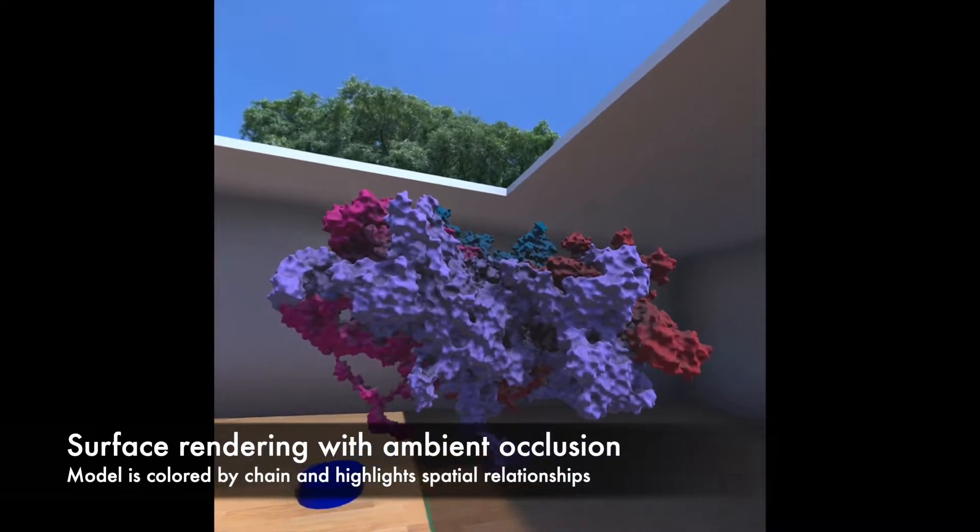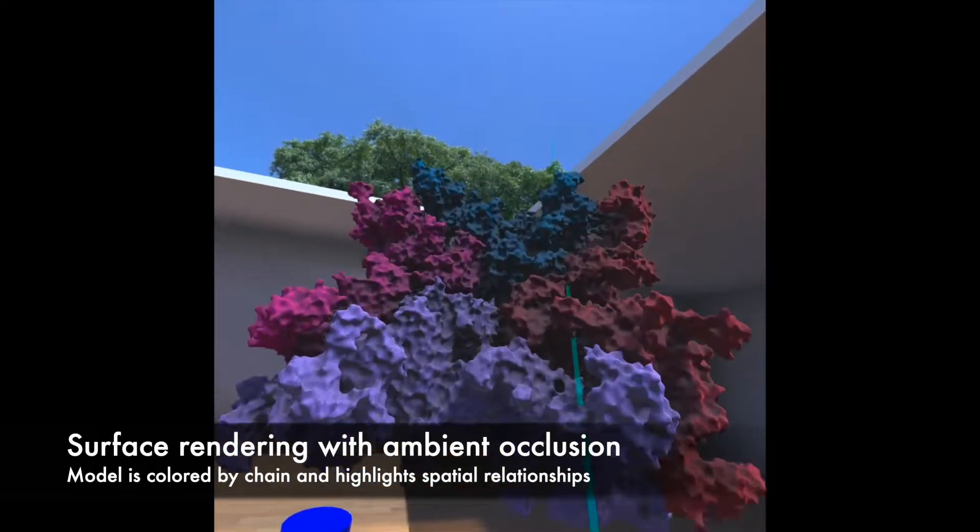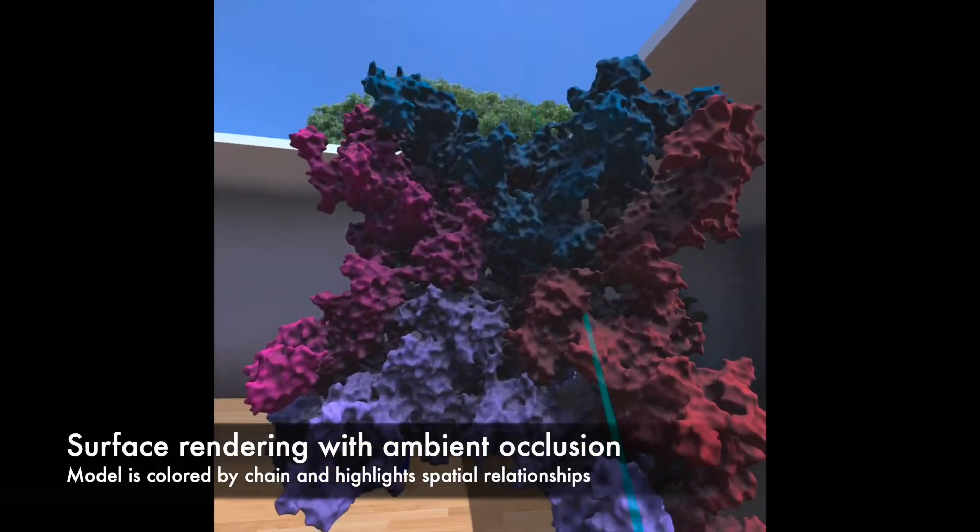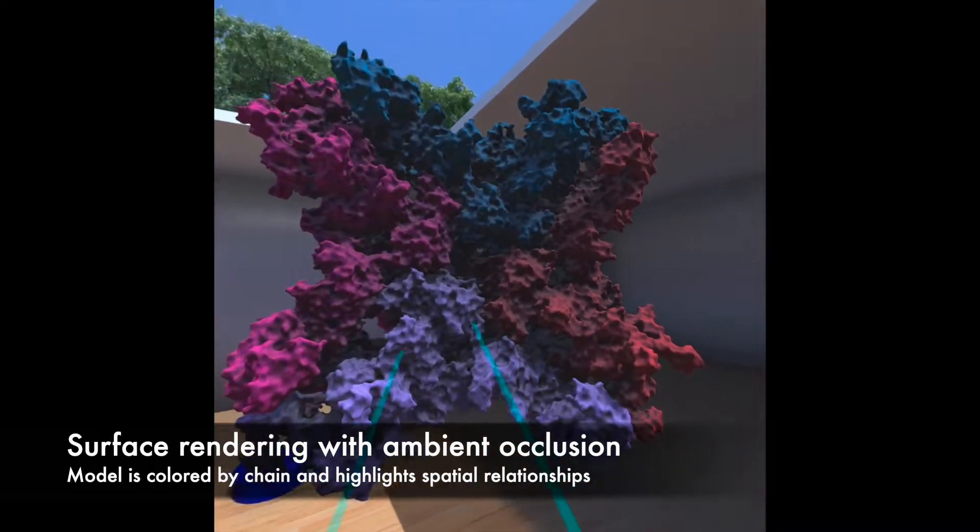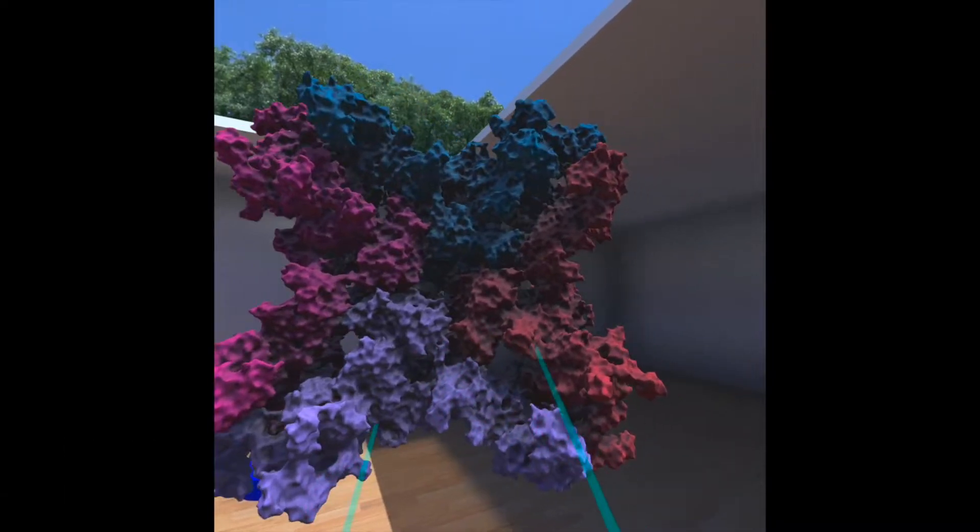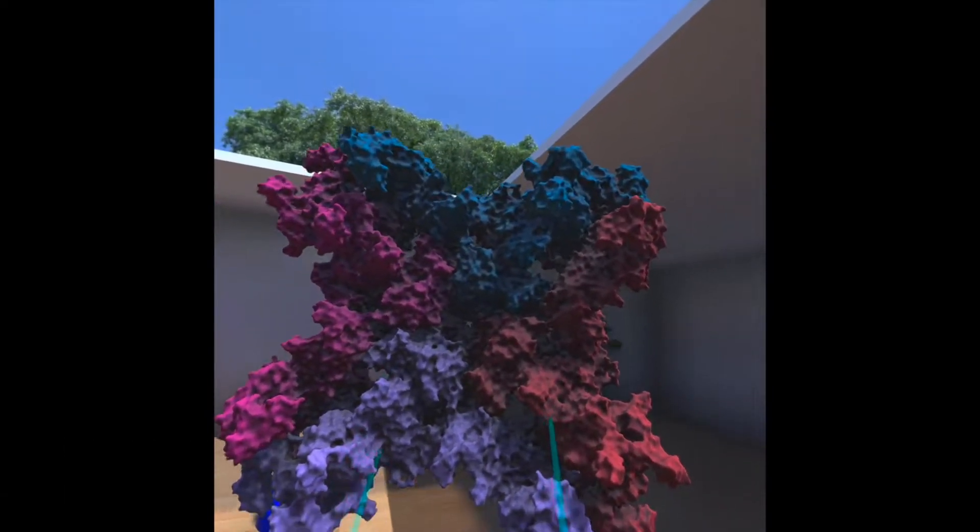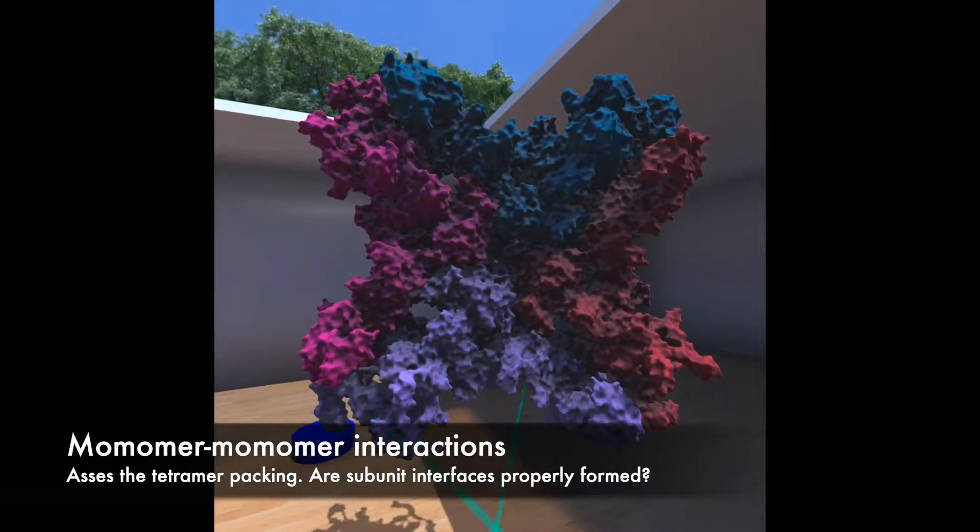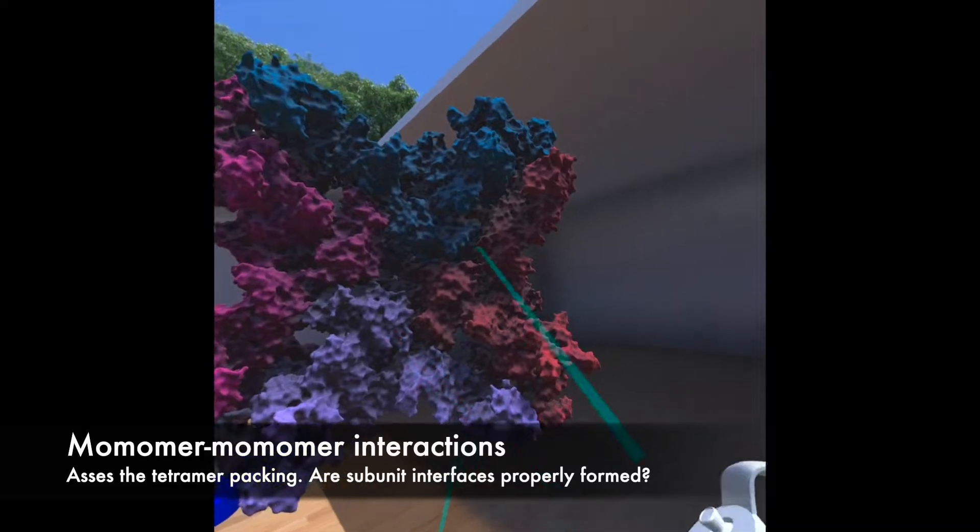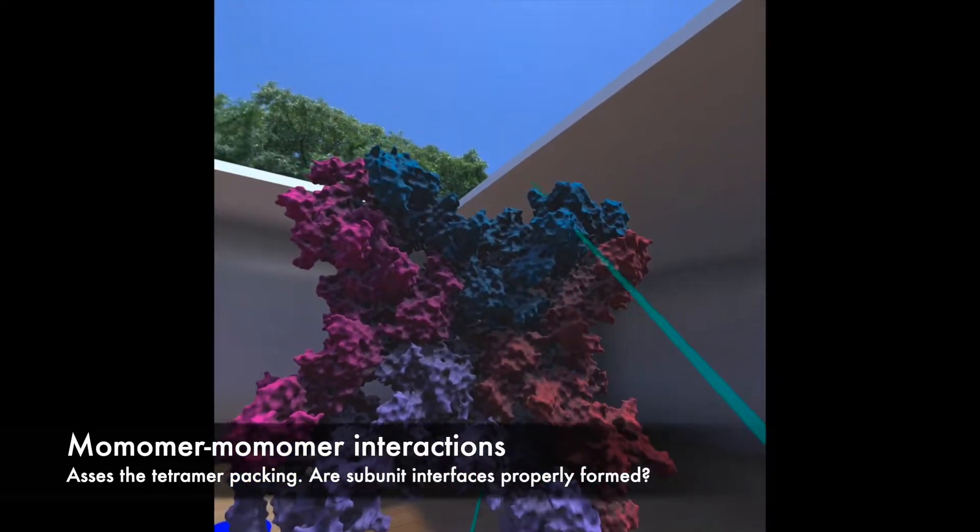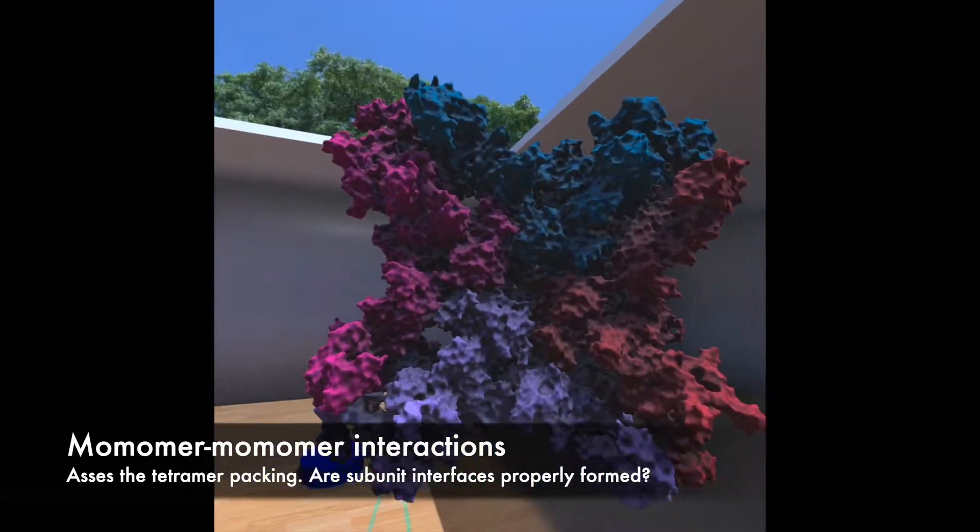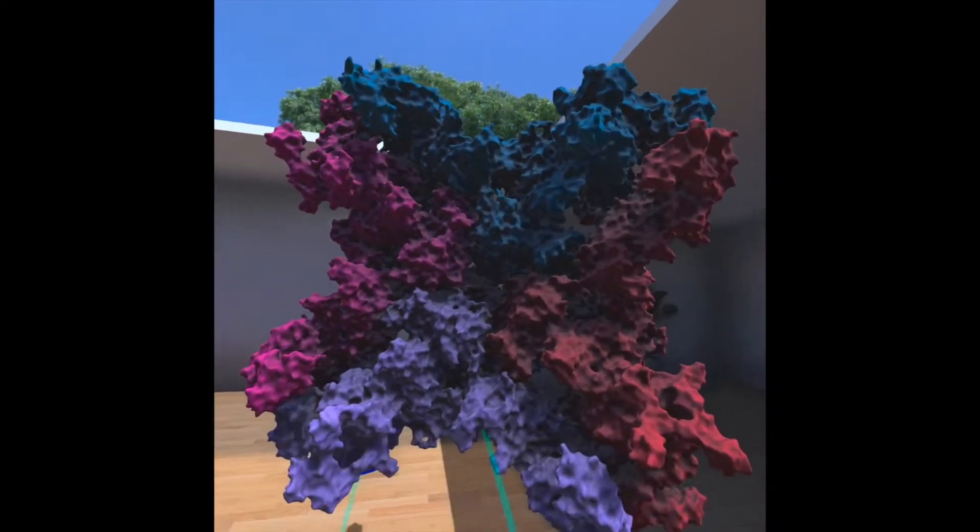Chain coloring. So here we can see the ryanodine receptor. You can see it's a tetramer. We have here in different color shades the four subunits.